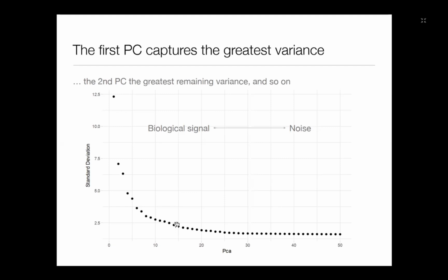So here I would like to give this question again to you. What would you guess is a good threshold here for the number of principal components? I went for 30 here, but you could also, I guess, try 10 or 20. Anything above 10, I guess, could work.